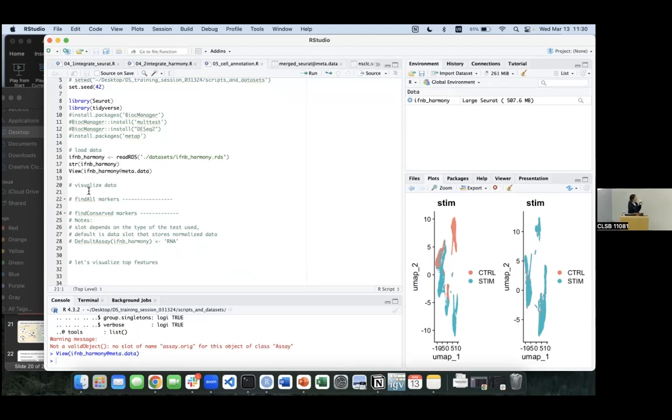So are people still following me? Show of thumbs. If you didn't follow the previous one, it's okay, because I have the datasets already provided for you. Could you show a thumbs up if you're at this step, number 5, cell annotation.R? Okay, awesome. Thank you so much, Diana.